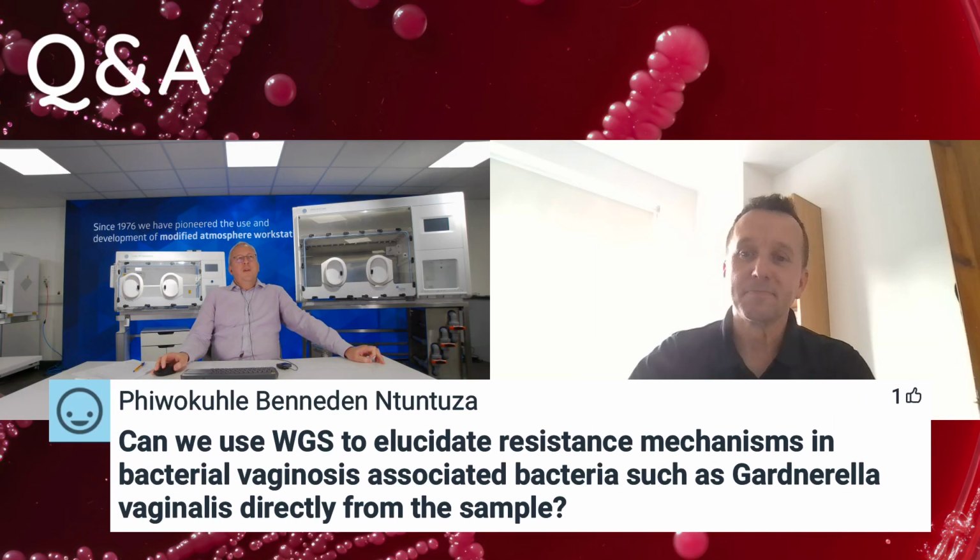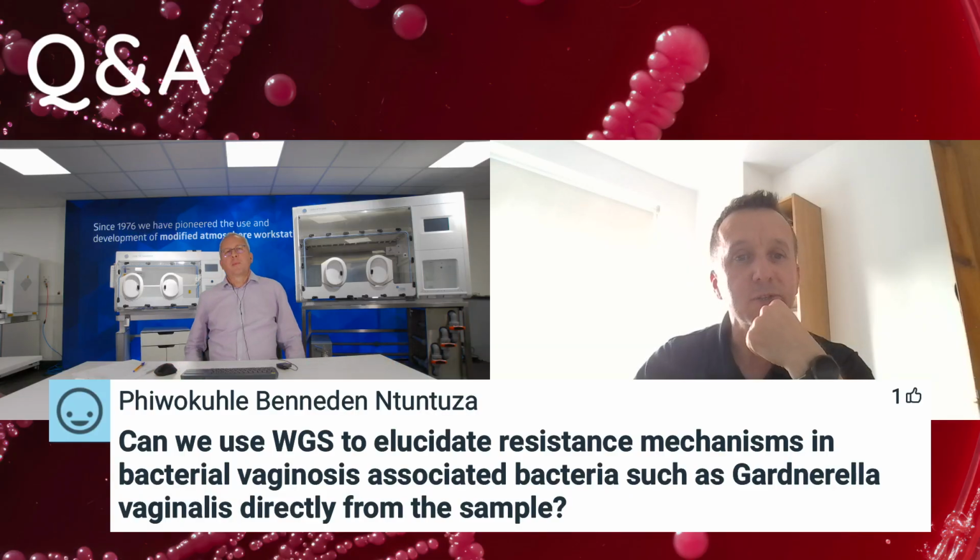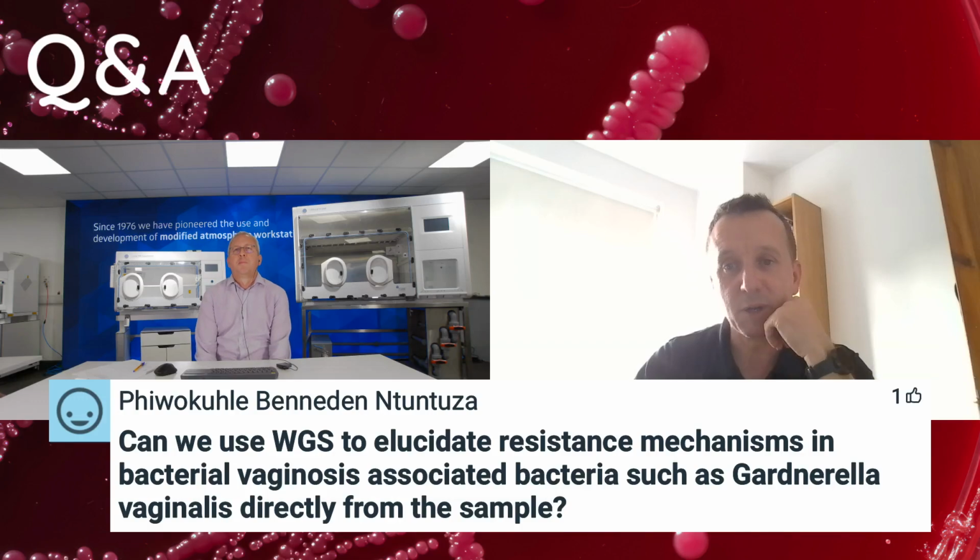And I think while I've been speaking, there's been one more question for you, which is, can we use WGS to elucidate resistance mechanisms in bacterial vaginosis-associated bacteria such as Gardnerella vaginalis? Can we do that directly from the sample? I don't think we can at the moment. Yeah. I think we still have to culture, which is one of the major challenges. But it's very much coming soon in the next few years, I would imagine.